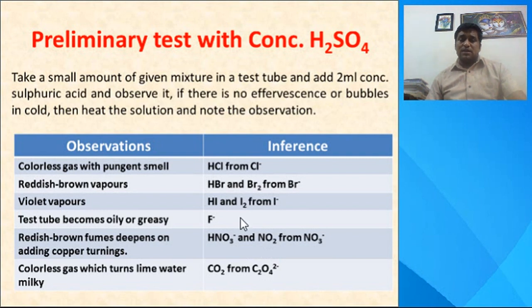Remember, these are just indications. They help us draw inferences about the presence of these radicals. To ascertain whether these radicals are present or not, we are going to do confirmatory tests.